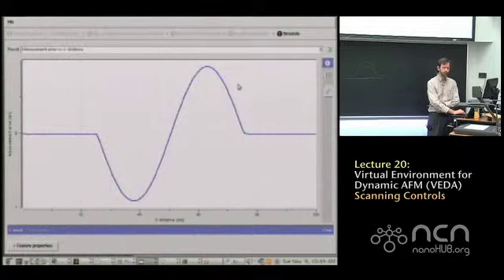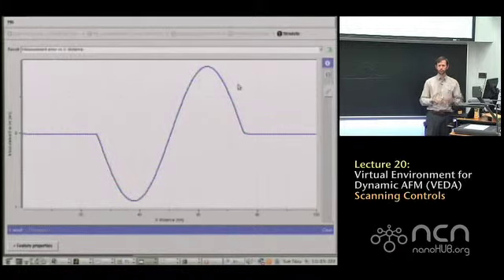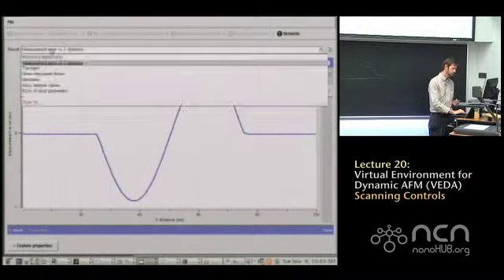In this region, we're making a positive error. That's essentially just because they're shifted a little bit. So this just subtracts those two numbers for you. You're often going to want to make sure this is small. Of course, in a real AFM, you don't know what the feature actually is, so you don't have this. You have to use your intuition to make sure that things are set so that this will be small.